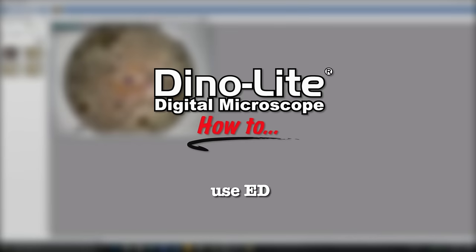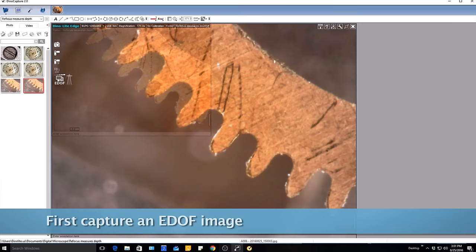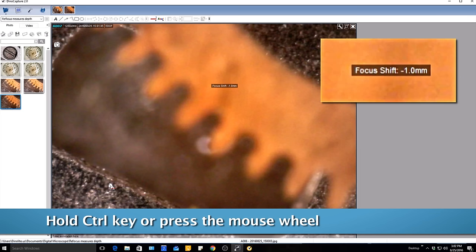Dino-Lite models with the EDOF feature provide an estimated depth reference point on captured EDOF images. To do this, open an EDOF image, then press and hold the control key or press on the mouse wheel to enter refocus mode.